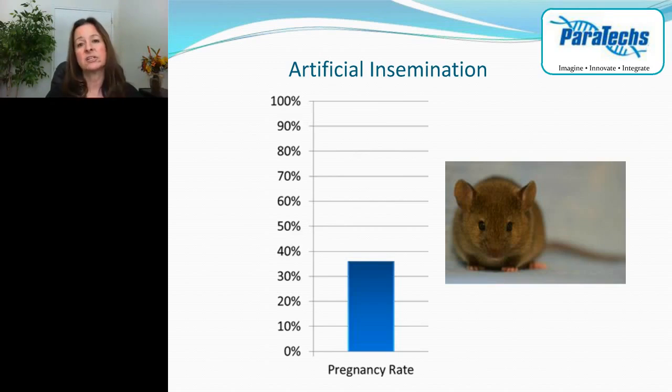There are two different things that we suggest. First of all, if you are an expert at handling animals and you're comfortable with the procedure itself, I would suggest either starting with euthanized animals, or you can also practice on animals that have been anesthetized.